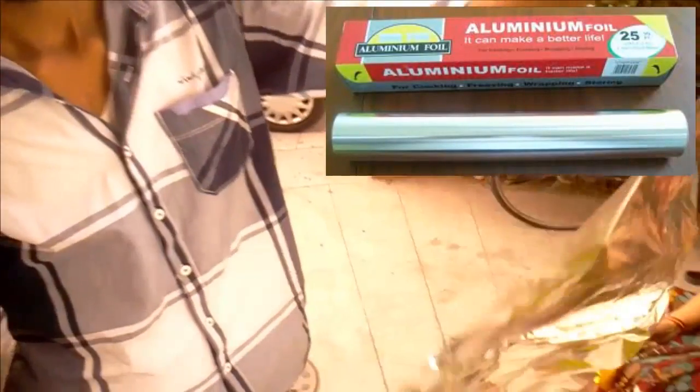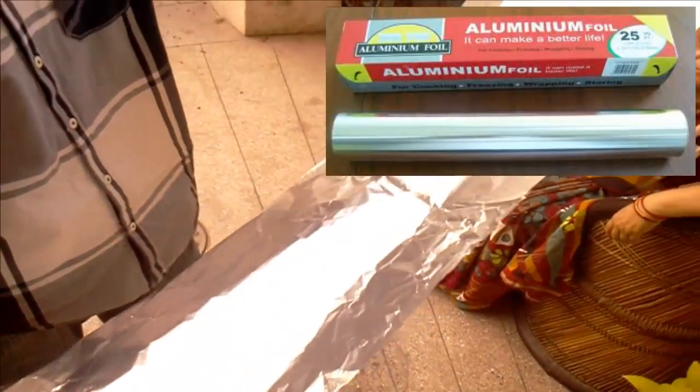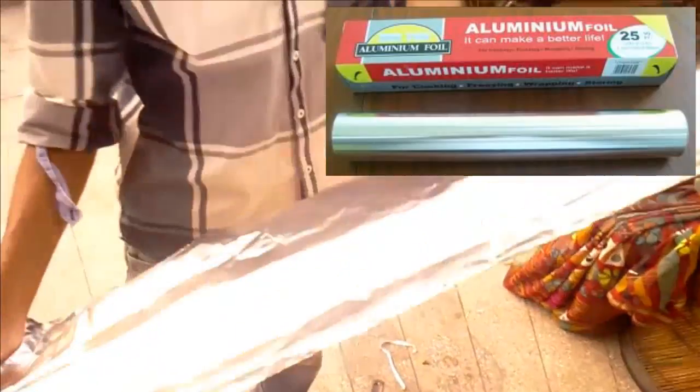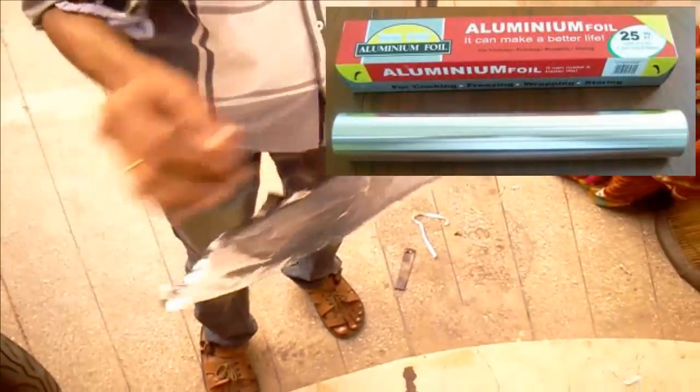This is a simple aluminum foil that we use for kitchen purposes. We have to take pieces and make small balls.